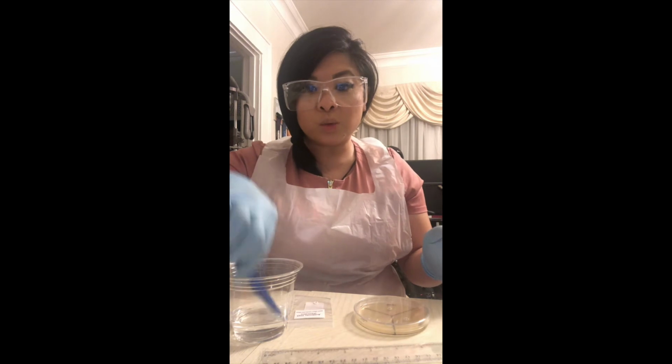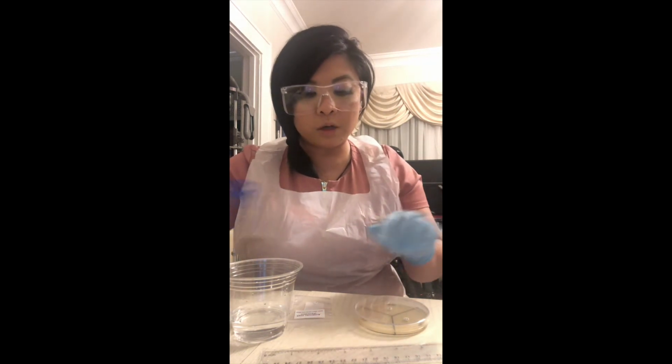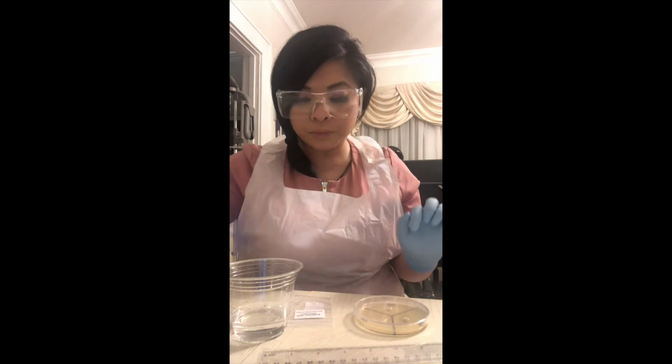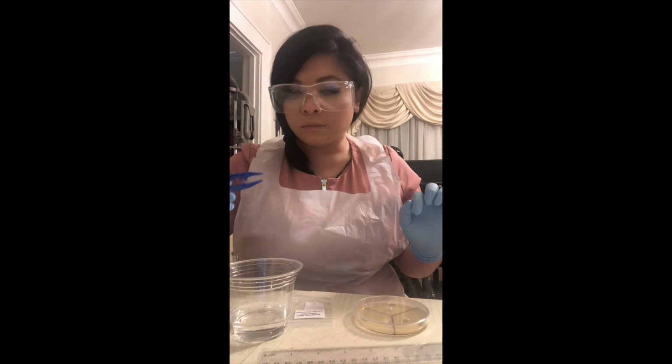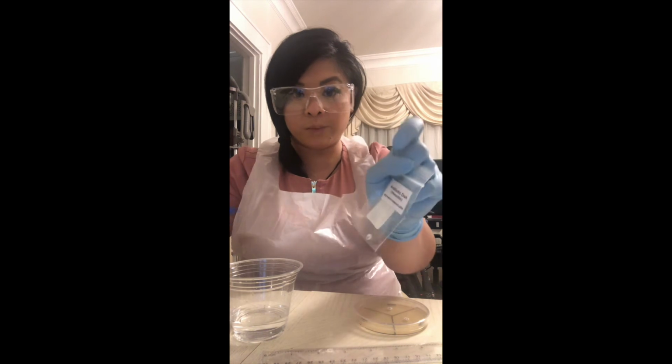So I have my tweezers that have been sitting in the alcohol for about 30 seconds from doing the previous antibiotic. And I'm gonna go ahead and shake it dry. Then I will be taking my antibiotic disc of penicillin.